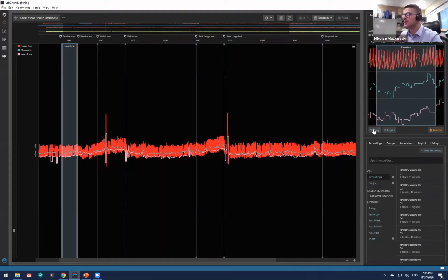What you can actually do here is, I know for this particular experiment that it's sampling at 200 samples a second. So within that, every sample per second is actually going to be found within this region. What I can actually do with this, I'll show you a bit later on in the webinar, but you can actually graph all of the data there into Excel or Google Sheets as an example, and that way you can just present regions in your presentations. So that's a pretty handy thing to have.